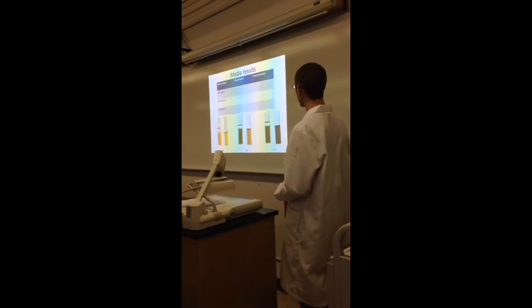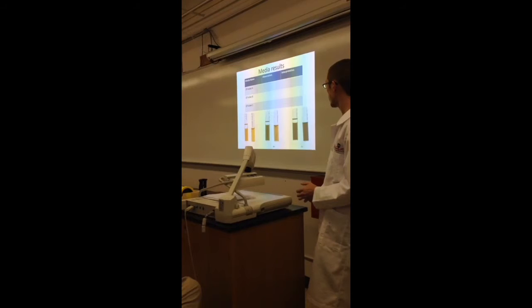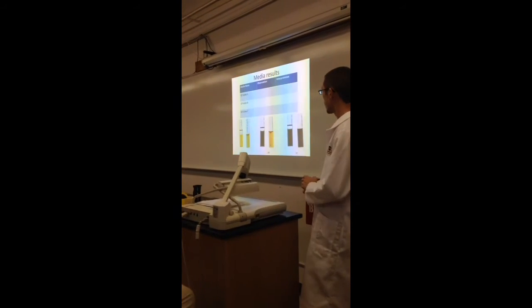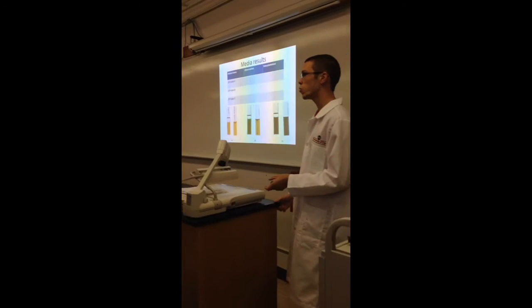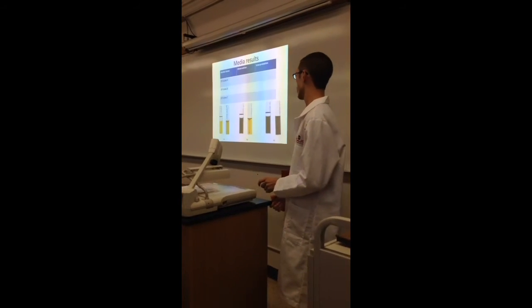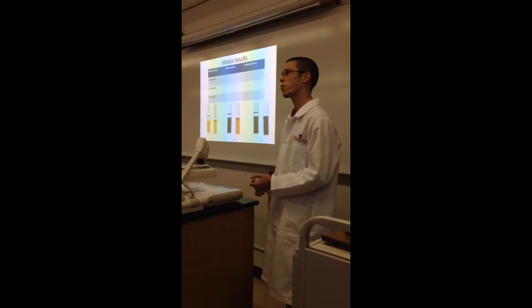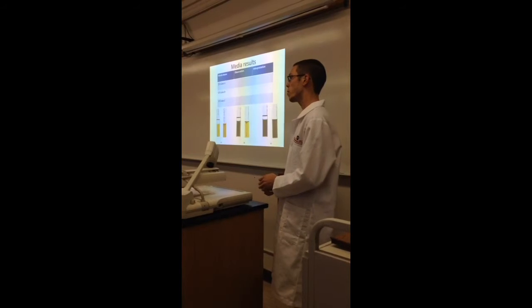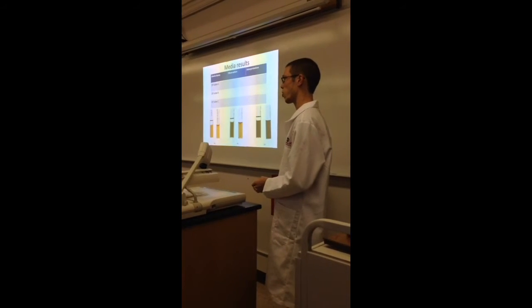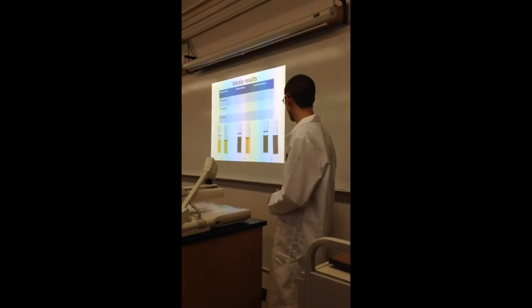So here's some media results for the OF tubes. The observations for A, B, and C. Now for one like this, when you have two tubes under a single observation, you want to make sure that you do write about both. For example, I'll just do A. You can write both tubes are yellow, that's fine. I don't need you to say anaerobic tube is yellow and aerobic tube is yellow. But you want to make sure that you include both in the result because both are important in your final interpretation. So what about for B and C?